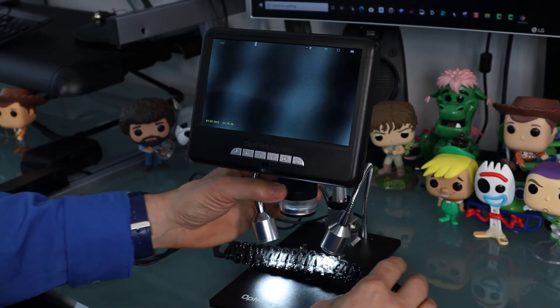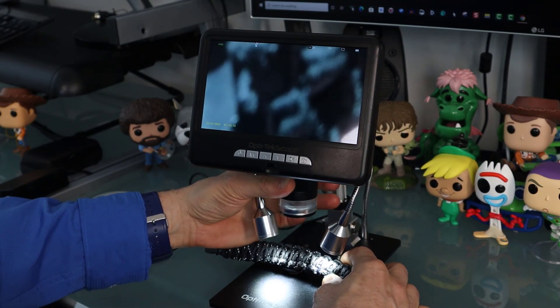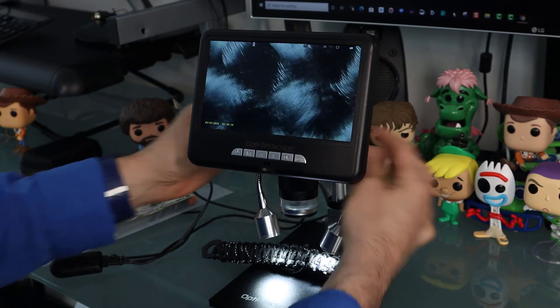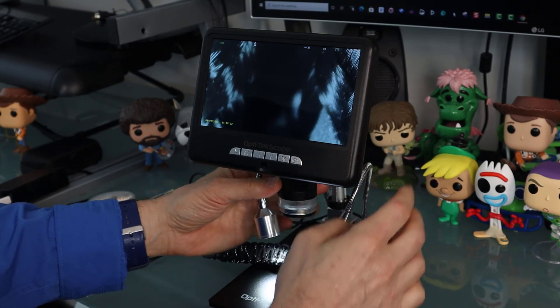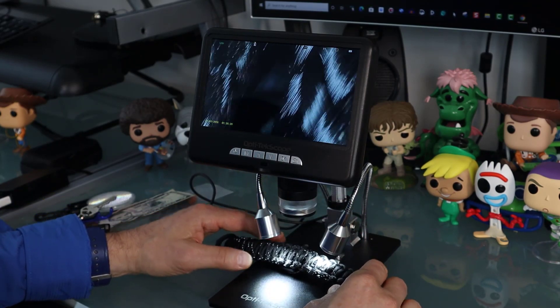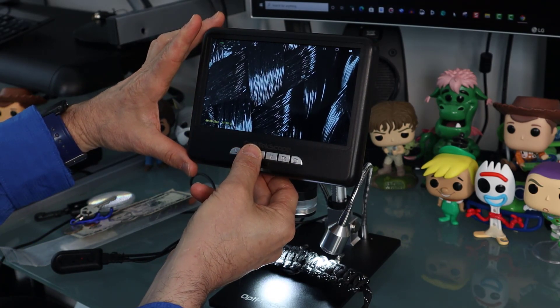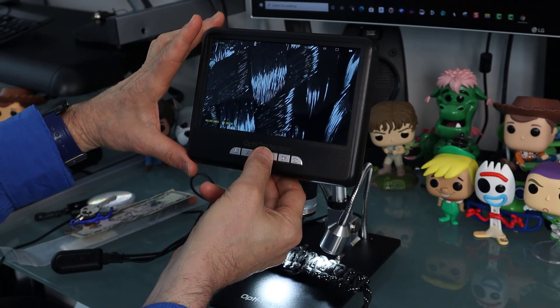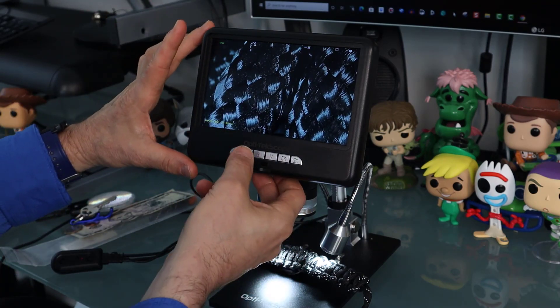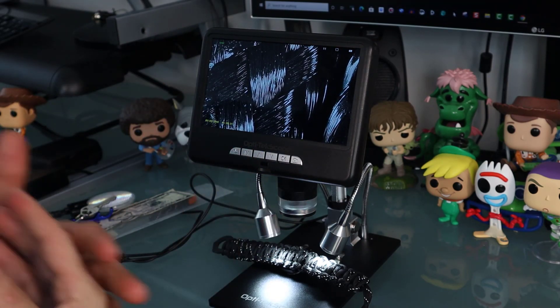Next we have this bracelet for hiking. We'll put that in there and look at that — look at the thread on that. You should be able to tighten the arm so it doesn't move around as much. There you go — that is a real good close-up of that thread. If I want to get really close to see the stitching, that is 2x and this is normal, and if you zoom in, that is times 4. Really amazing.